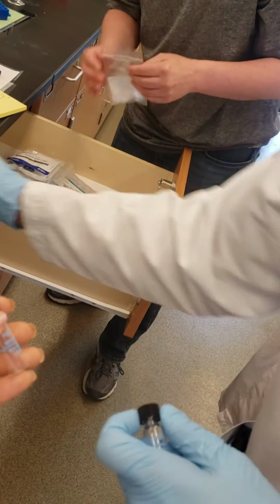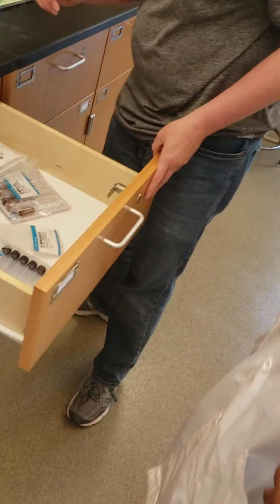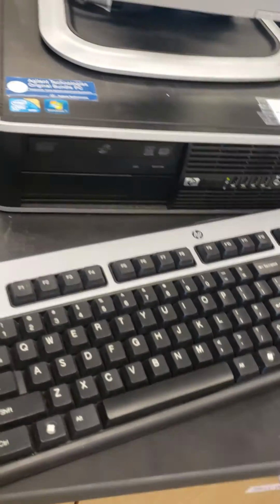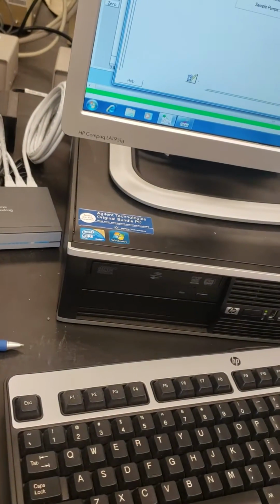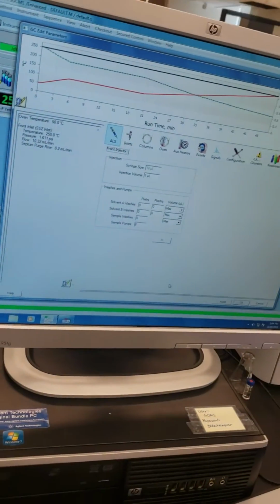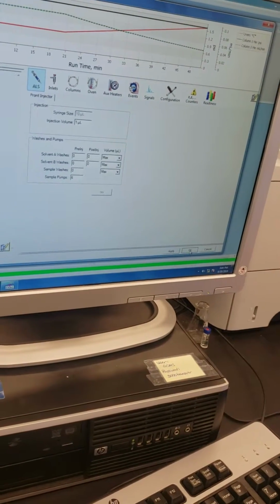Wait, wait, wait. With one pop, it's okay. This one? The other one is the pause. Once we're done, it's okay. All right, and once you've edited everything, you put OK.